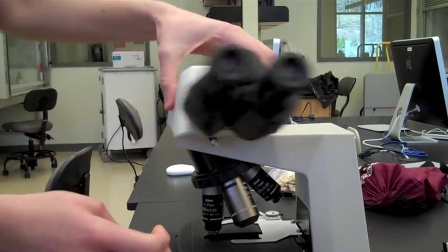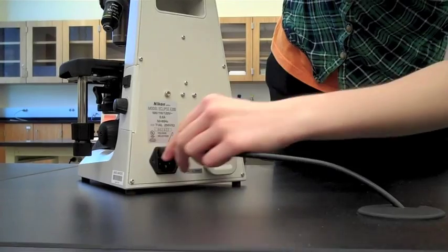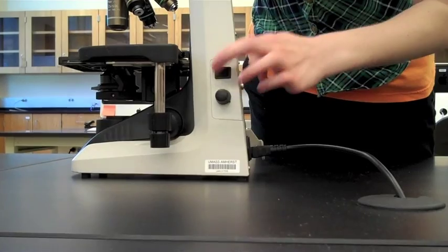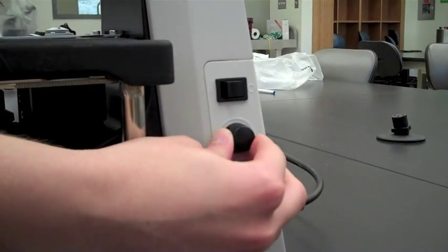Turn the silver dial to rotate the eyepiece. Make sure not to turn it too far. Plug the power cord into the back of the microscope. Flip the switch on the right to turn on the lamp. You can also adjust the brightness of the lamp.